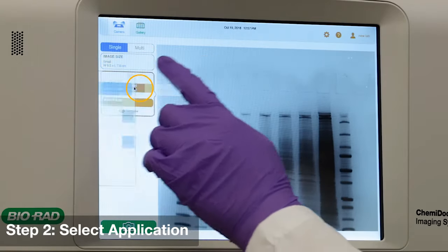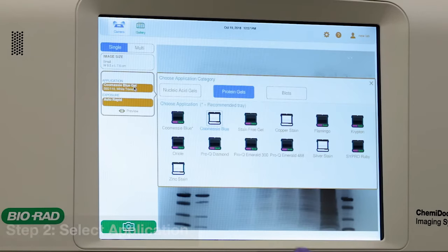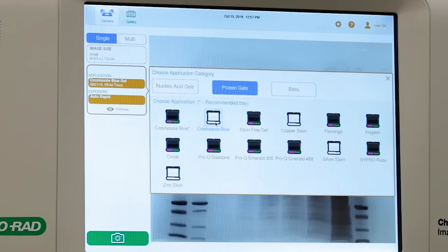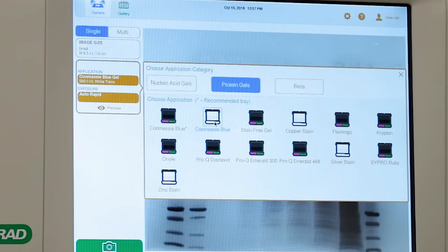Tap application to select the appropriate category and the stain for your sample. In this example, we are examining a protein gel stained with our BioSafe Kumasi Blue Stain.